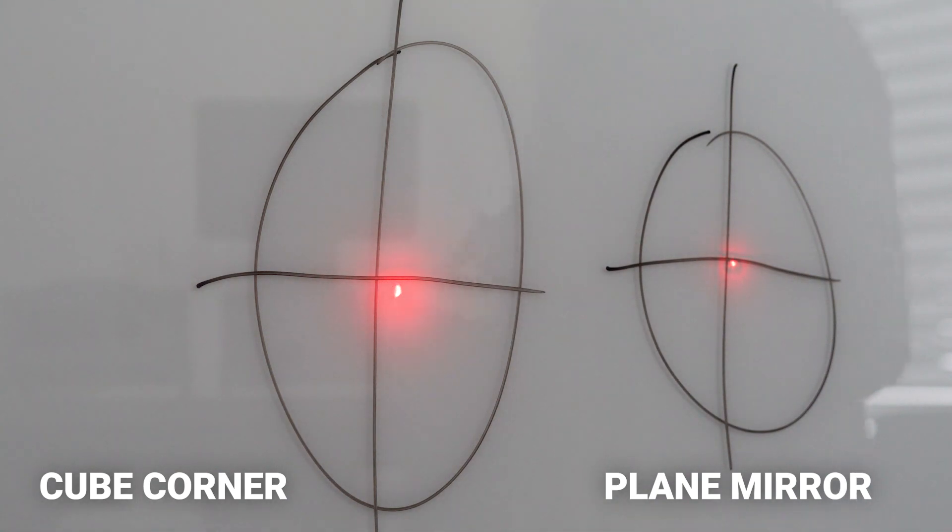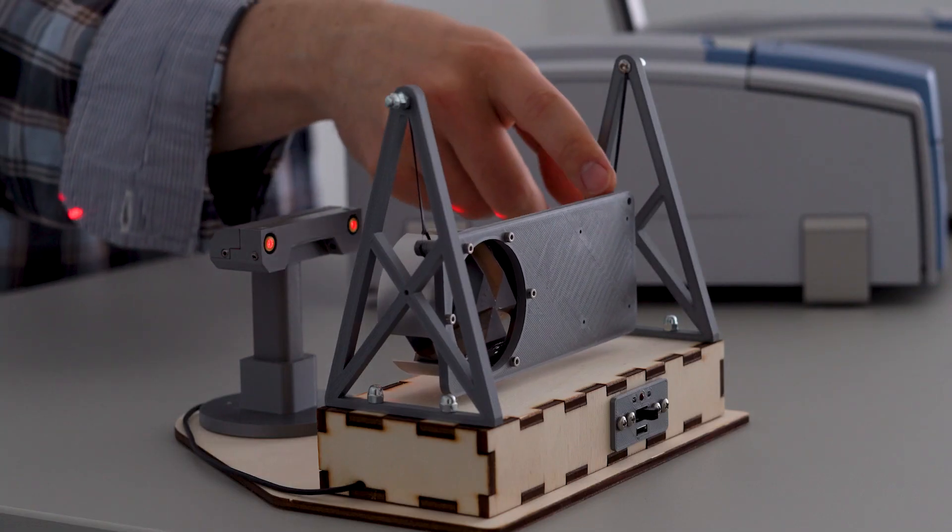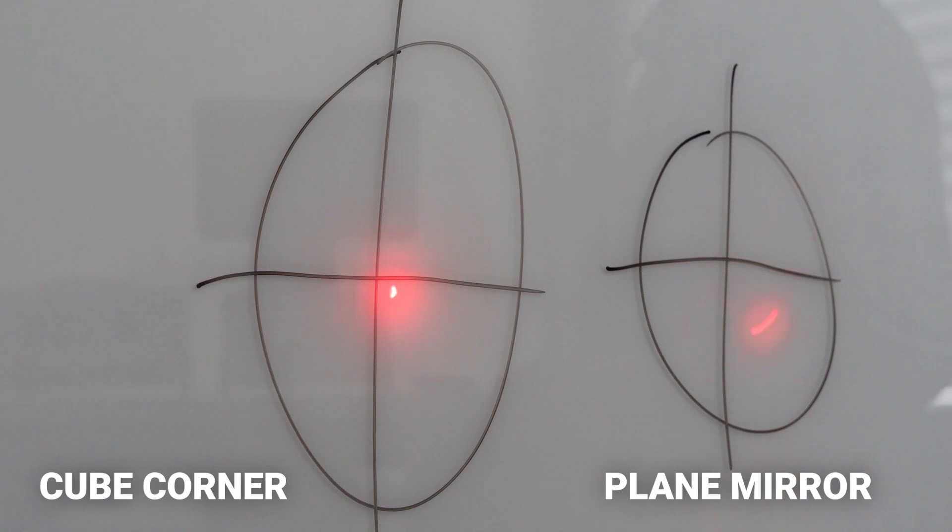Now it's time to give the device a little challenge and introduce an external disturbance. The plane mirror dot is going crazy, leaving its mark completely. You can also see the laser beam moving in all directions.